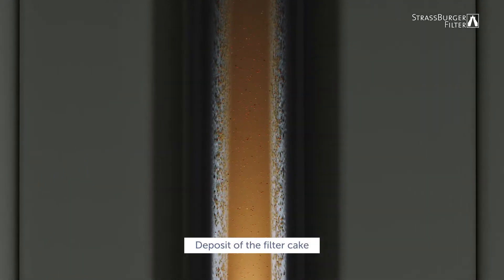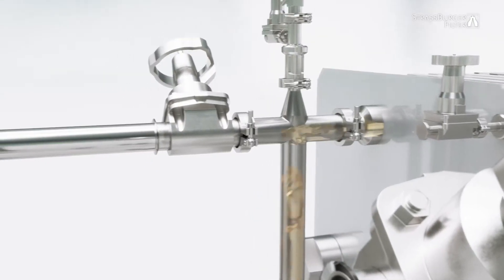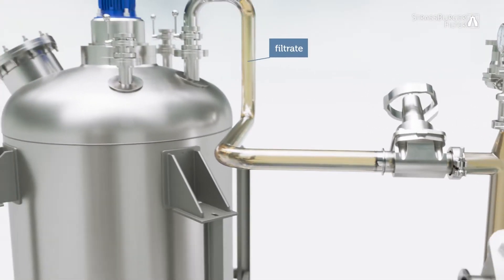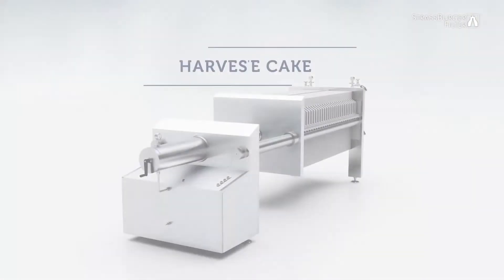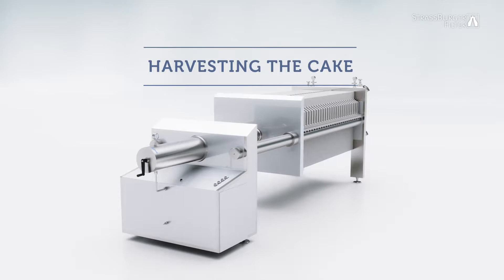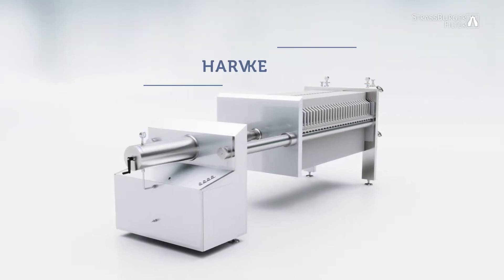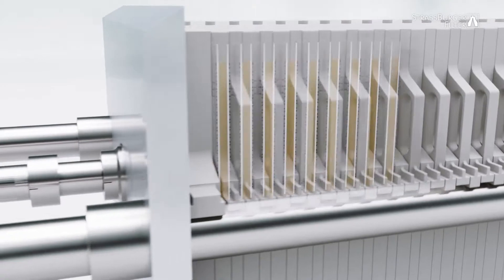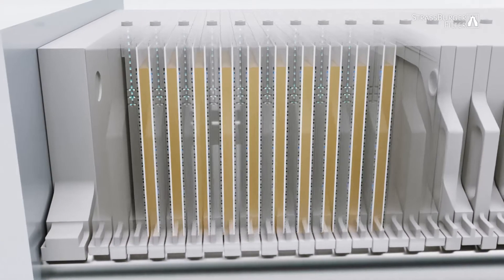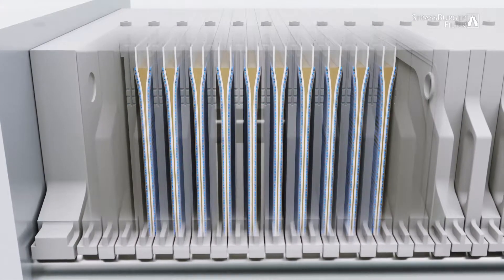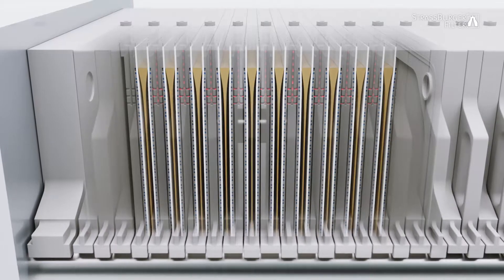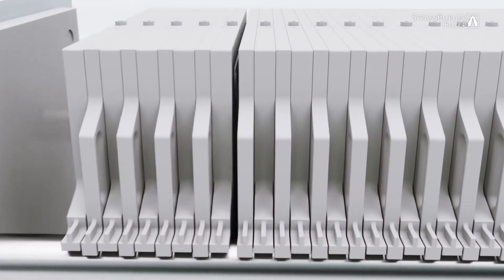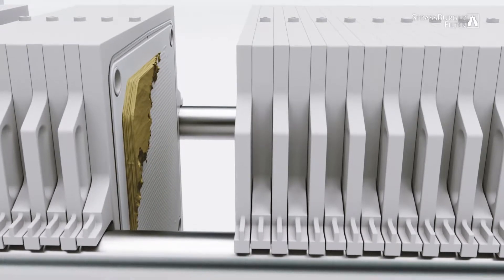The so-called filter cake forms and the filtrate flows into the filtrate tank. Optionally, membrane plates ensure maximum product yield by repressing the filter cake or the possibility of cake washing. The filter press is opened to remove the filter cake after filtration.